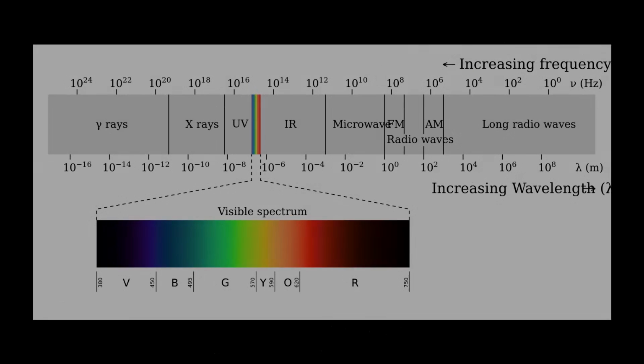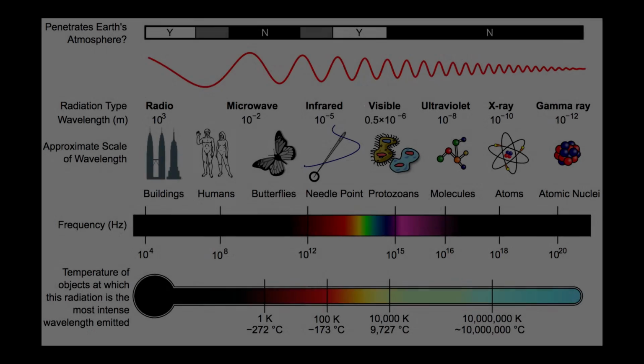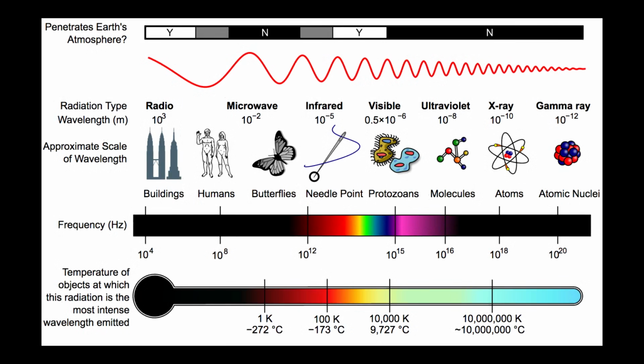It all depends on how we observe the beam of light that comes to our vision field, and also the wavelength of the light. We cannot see anything smaller than the wavelength of the light emitted. Therefore, we can magnify things up to 1,500 times, and we cannot see anything smaller than 0.2 micrometers. A micrometer is one millionth of a meter, or one thousandth of a millimeter.